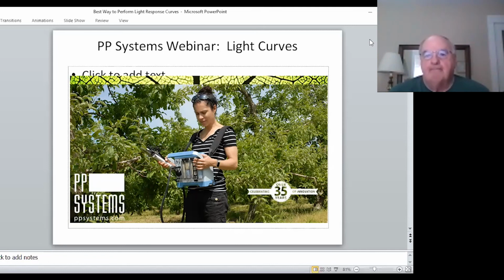Okay. Is photoinhibition a concern at very high light? It is for a limited set of species that are adapted to very dim light and basically never get exposed to high light. If you're dealing with those species, then you need to take care that you don't start them at light higher than they can tolerate. But that's a matter of trial and error and knowing your species. For most species, that's not a problem.